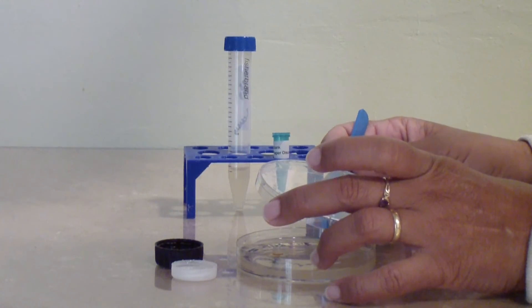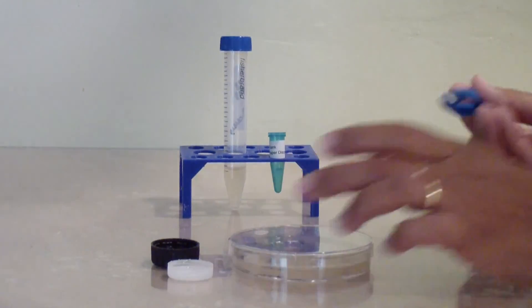Turn the plate over and incubate it in the warmest part of your home until the bacterial lawn is obvious. Usually one day is enough.